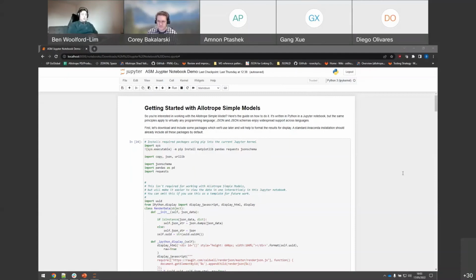Yes, that was part of the specification for the RFP. We wanted to make sure that bidirectional conversion was in fact correct and valid. So we do have a tool for that. I've got to double check what our release status on that is. I think it's in one of the accessible repositories, but I wouldn't swear to it, so I'd have to double check on that. But the intent is that yes, we will make that available.